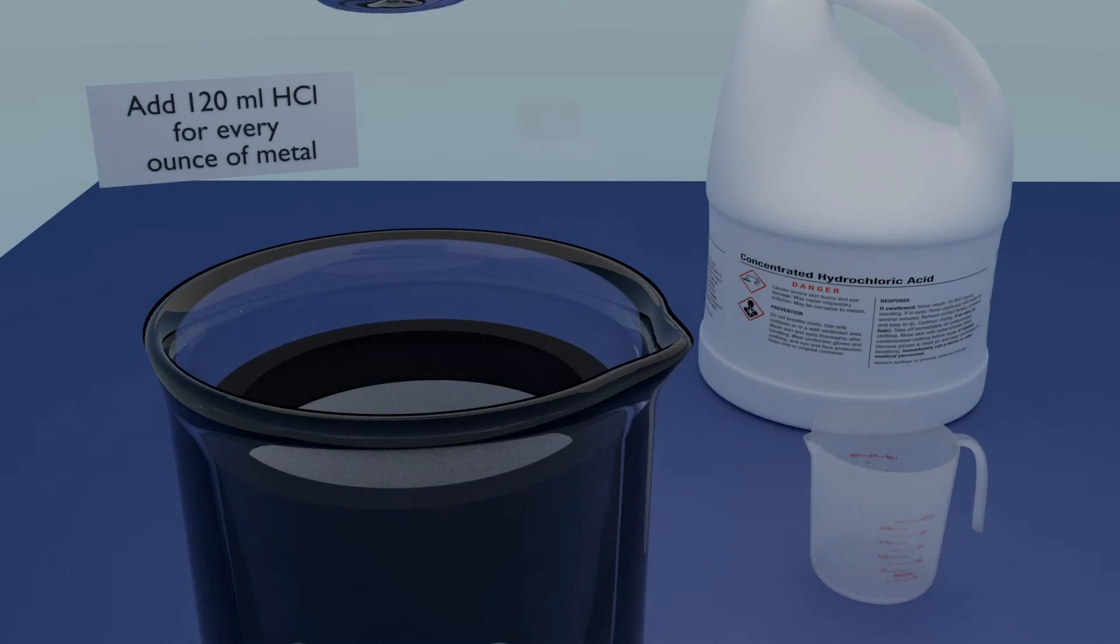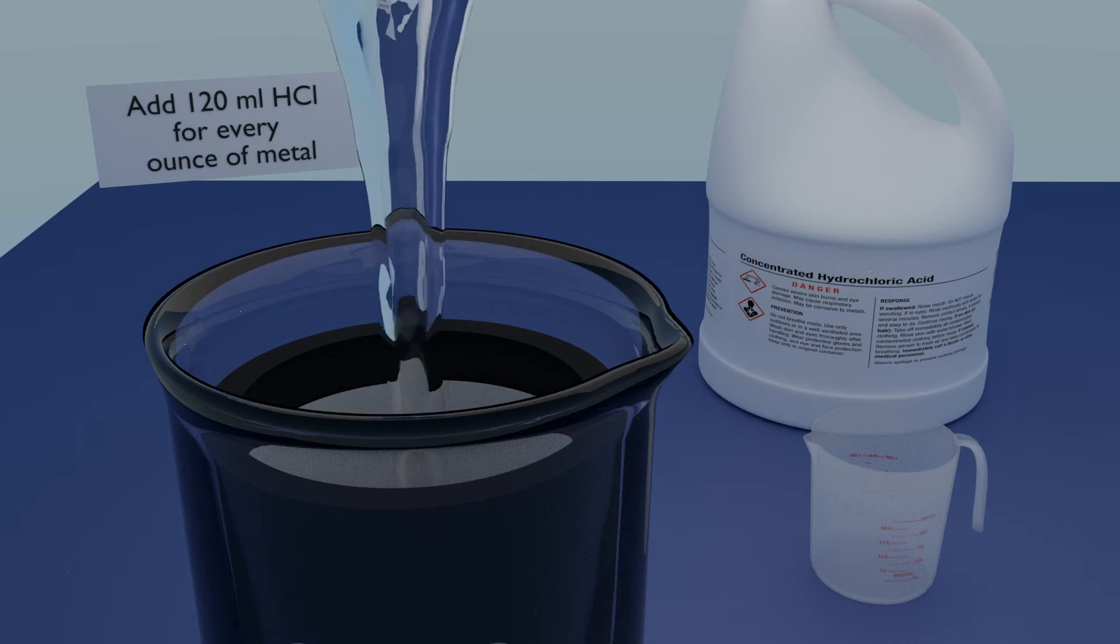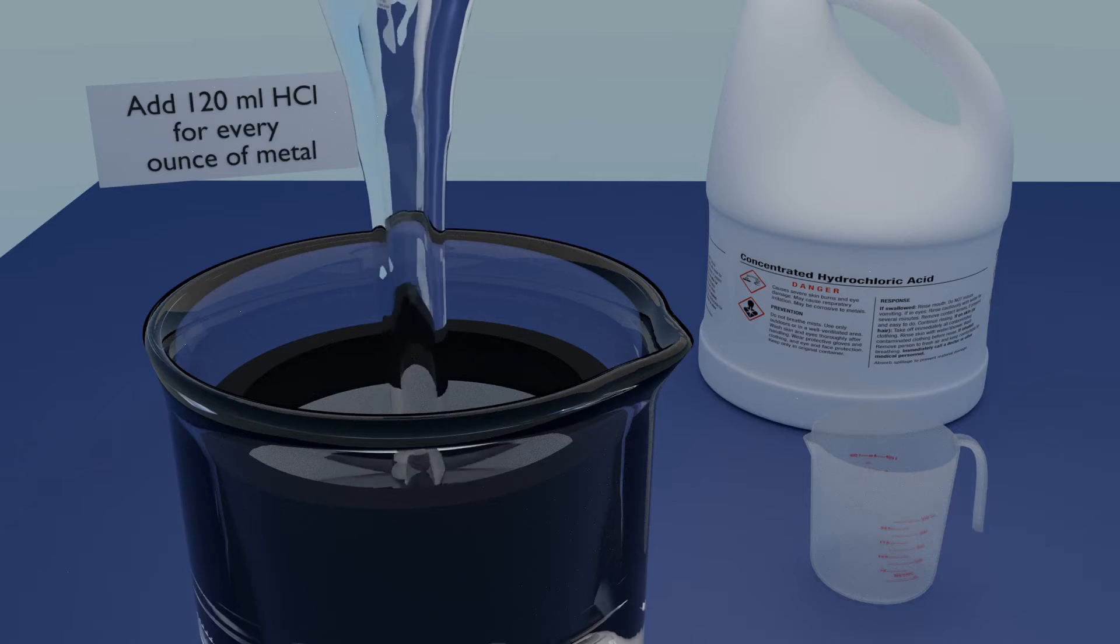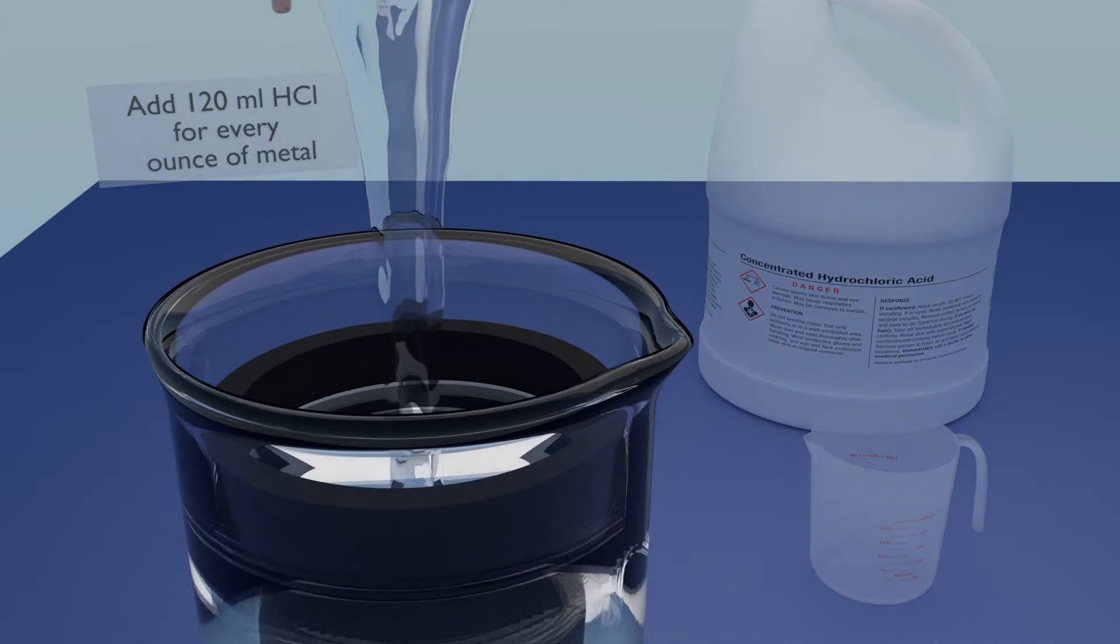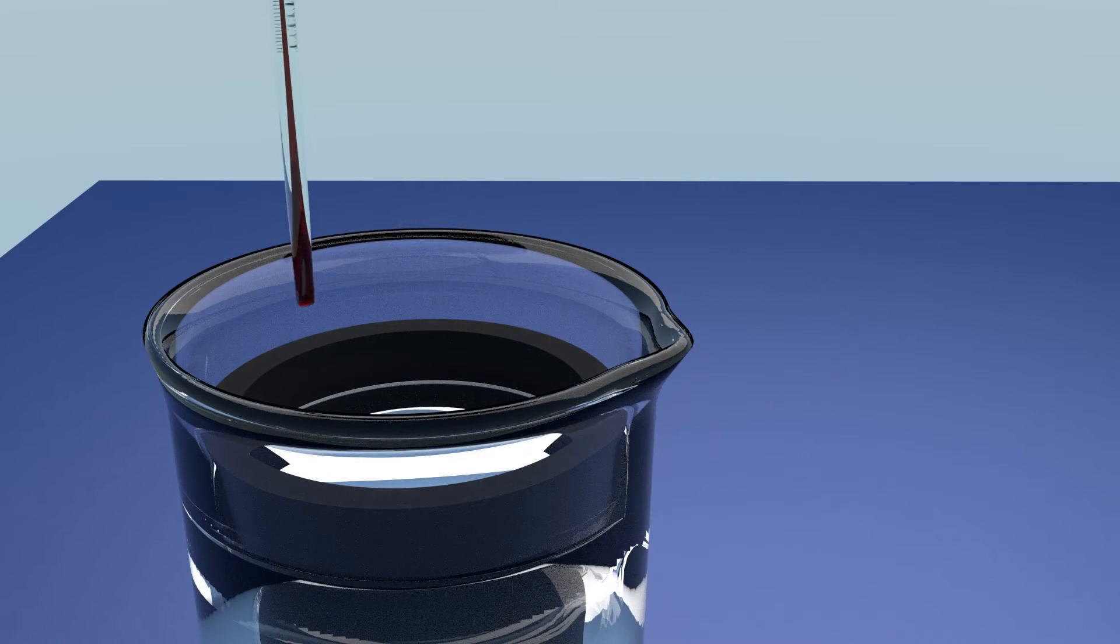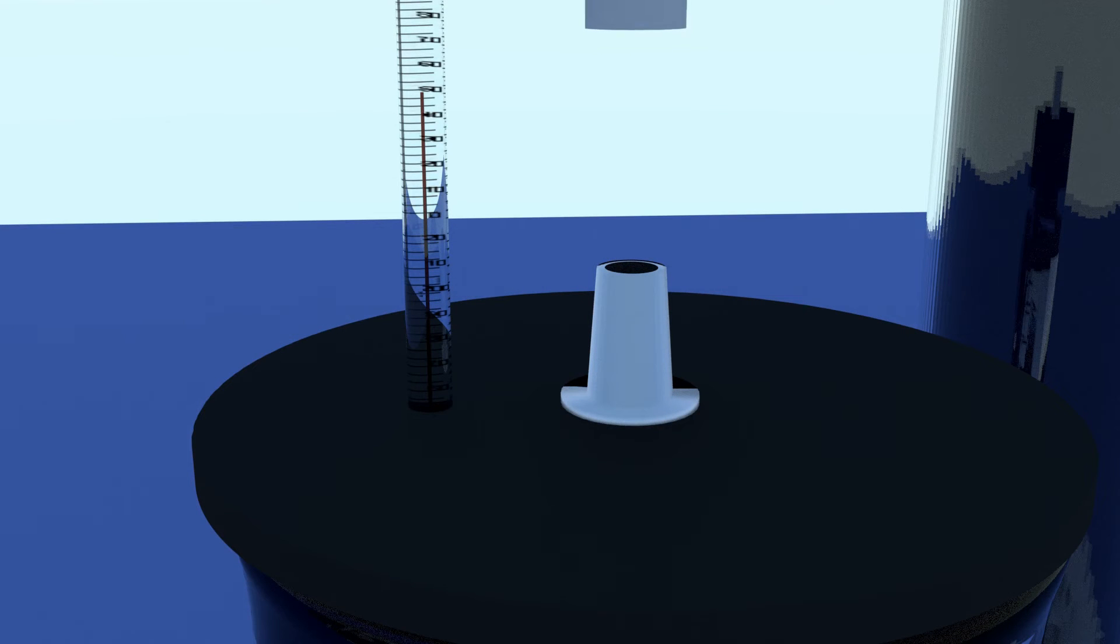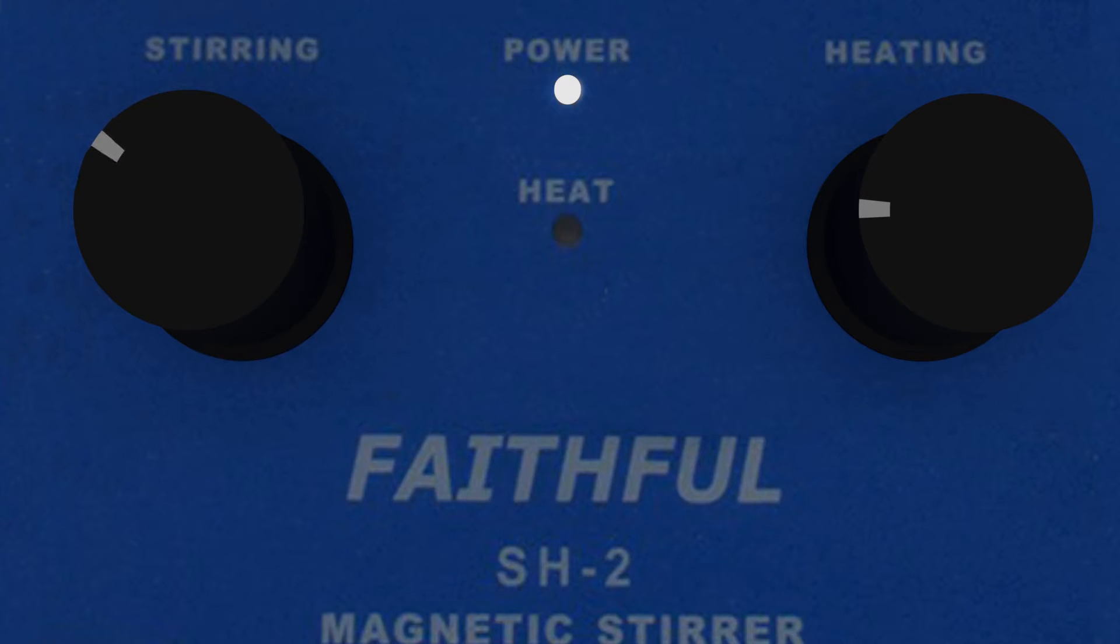Take the beaker to a well ventilated area, preferably outdoors. Add 120ml of hydrochloric acid for each ounce of metal. Replace the cap and bring back indoors. Connect the quick connects. The fumes will now pass through the scrubber, removing both their smell and corrosion. Turn on the magnetic stirrer and then slowly increase the speed to about a quarter setting.